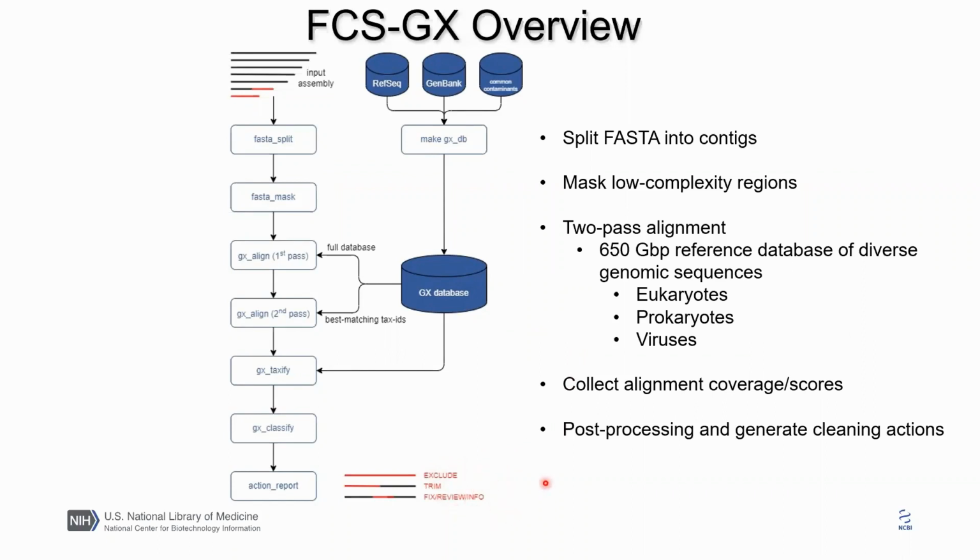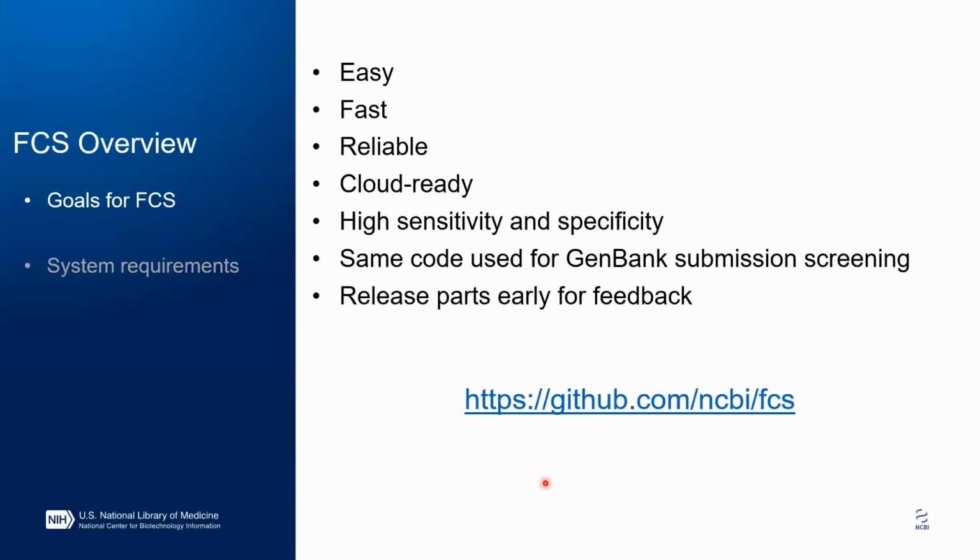Users are guided to remove sequences entirely, trim off ends or internal segments, and some lower confidence alignments may be in scope for further review. In the future, we will implement a clean FASTA step similar to FCS Adapter that automatically generates a final FASTA file after interpreting the action report calls.